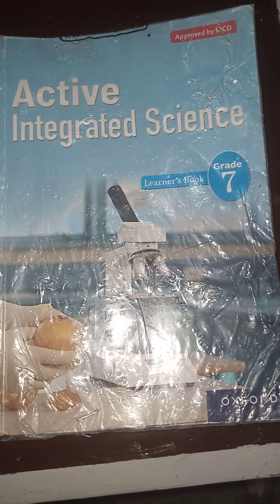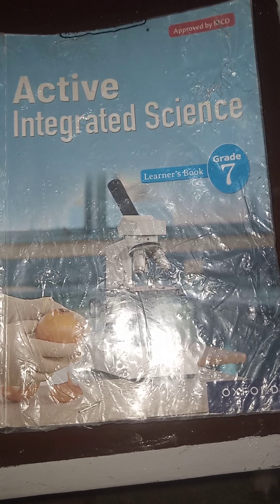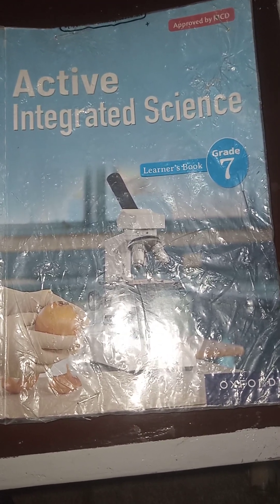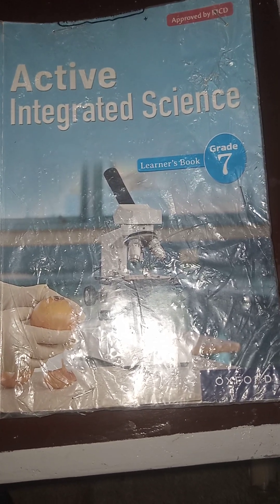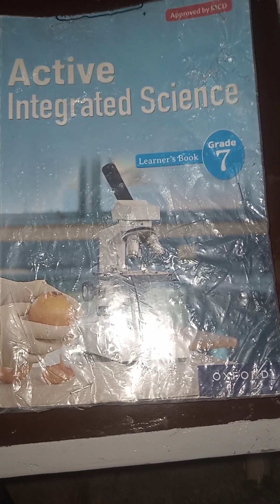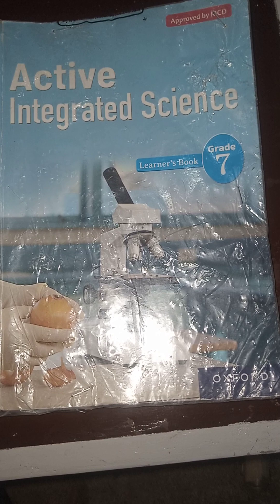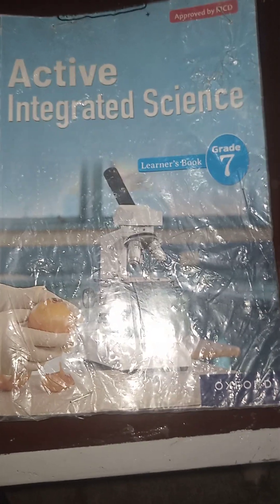Today we are going to carry out a simple exercise in one of the CBC activities in the integrated science subject. This is for grade 7. The exercise we are going to carry out is about separation of substances which are mixed together. In this particular case we are going to come up with an apparatus made from locally available materials to separate water and salt from its solution.